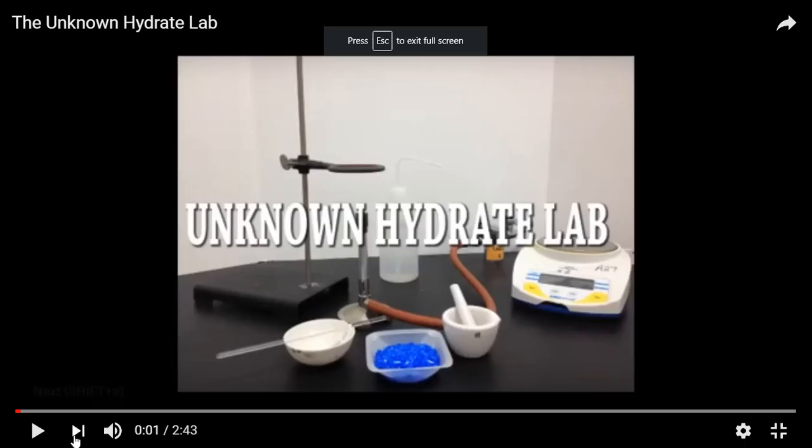Okay, so all right, this is to determine the formula of an unknown hydrate. What that means is we know the formula of this blue compound, I believe it's copper sulfate, but we don't know how many water molecules are attached to it. So that's the unknown part, okay? So let's watch the video and I'll explain it.